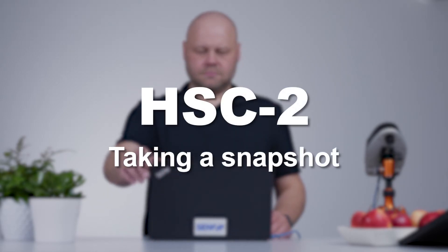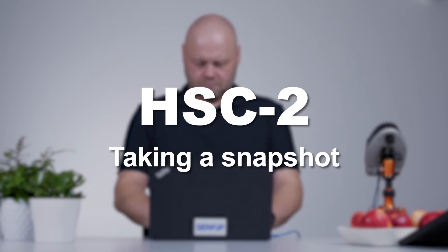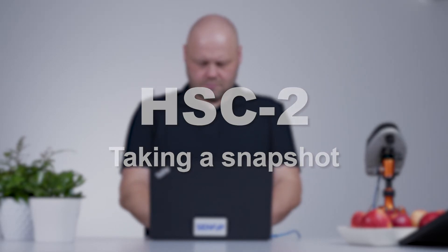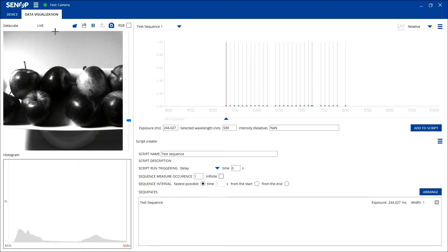Taking a Snapshot with HSC2. The snapshot function on the HSI2 software enables the user to measure one sequence and see the spectrum of the image seen. Go to the Data Visualization tab.